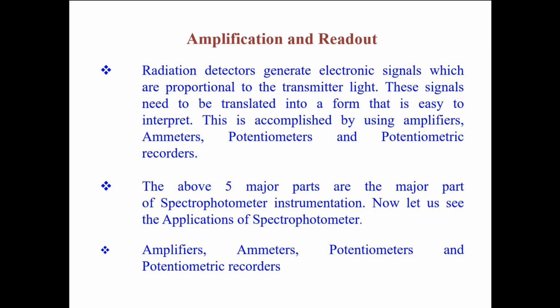So diffraction takes place, and the light will be separated into its individual components, that means individual wavelengths. Then the light which is coming out will fall on another lens, and it directs the single monochromatic light to escape from the monochromator box. Okay, so the exit slit will be there, and that particular wavelength will escape from that exit slit.